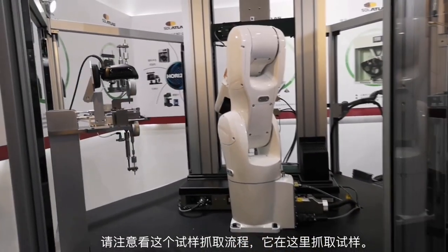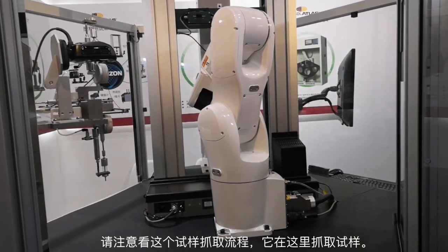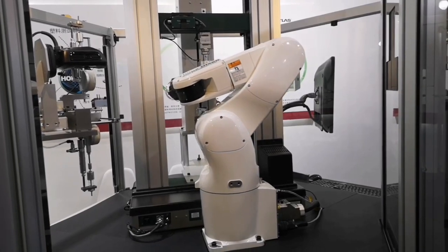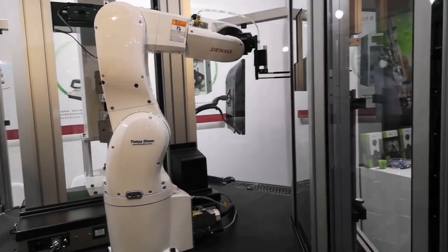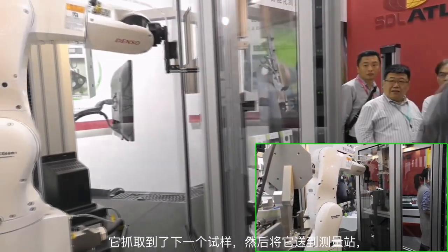Keep an eye on the picker system here — watch it pick up the specimen. Right here. All right, got the next specimen.